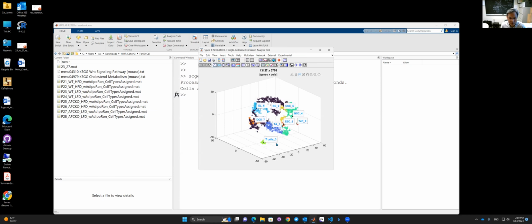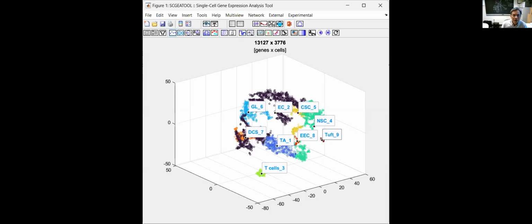What I realize is there are subscripts like -3, 8. Do you think they're meaningful? This 4, 3, 5, they're just labels, index. I'm not sure because I can't see that part. I'm not sure what labels you're talking about. Okay. Yeah, that's a problem. Okay. Yeah, I don't think the number is too important. It's not important at all.